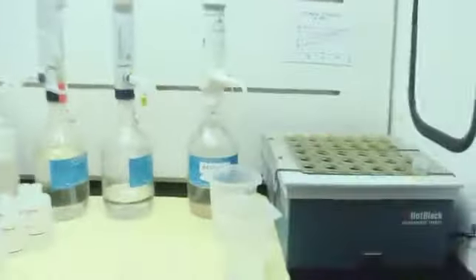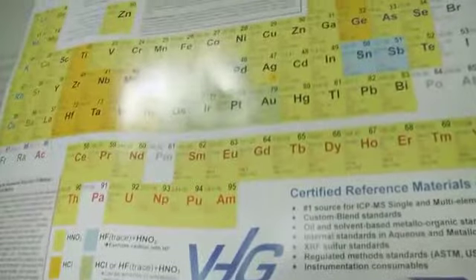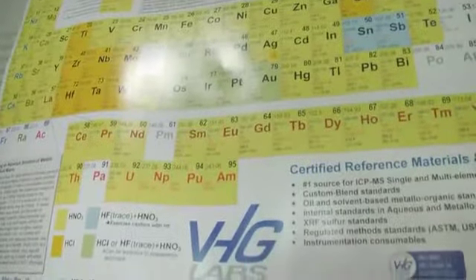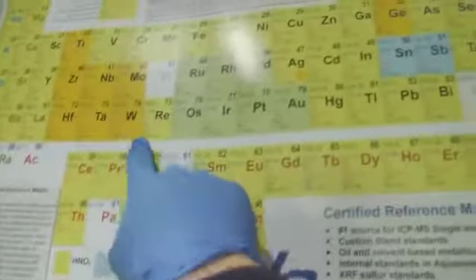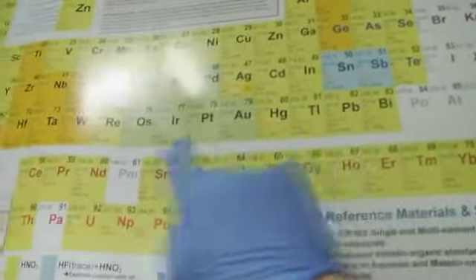But I wanted to show you actually something up here, because this is really how I discovered tungsten in brown rice or rice protein products. Now, if you go over here and take a look, this is a periodic table reference chart for atomic spectroscopy. You can see tungsten here, and of course mercury is here. And I wasn't even looking for tungsten. I was actually looking for mercury.